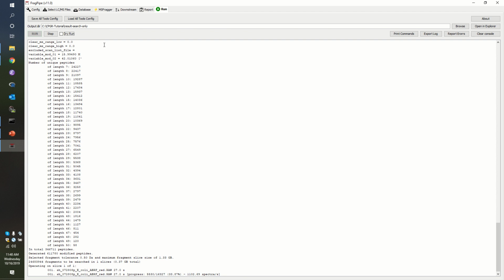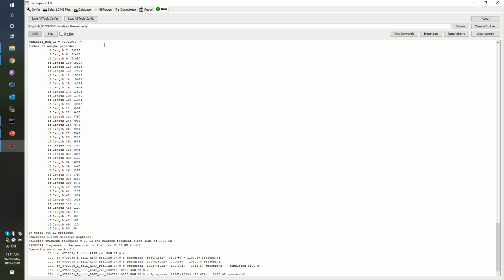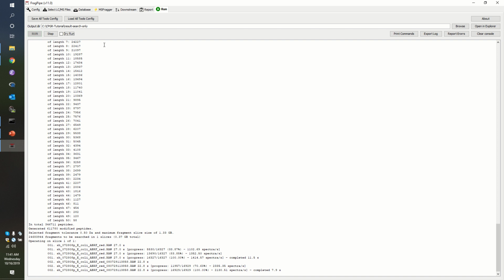There's a puzzle happening, so I'm going to check in on how those are going. I'm not able to run the list. Okay, is it complaining about the space in the path name? It just says here, insufficient memory, predicted minimum memory is 4 gigs. Ah, all right. So you've run into a nasty little catch that shows up with MSFragger. MSFragger is really, really fast, in part because it is able to use lots of memory to do these things quickly. In your case, your machine has run out of RAM available to it in order to make that search happen in the space you need.